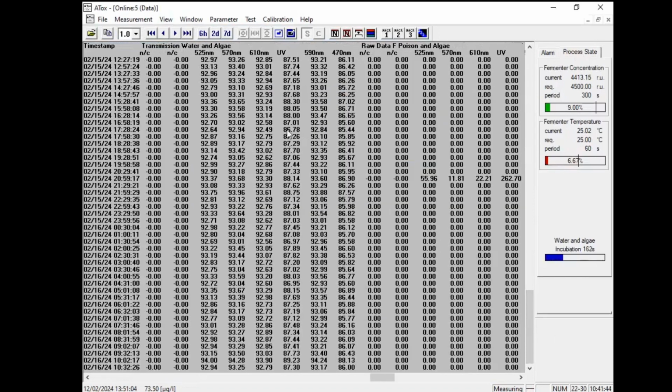There's no graphic display for these transmission values because normally there's no use for it, but these data are present, and you can look for it if you want. There's a lot of data you normally don't need, but it is there in the database, and this is a window where you can see numerical data.